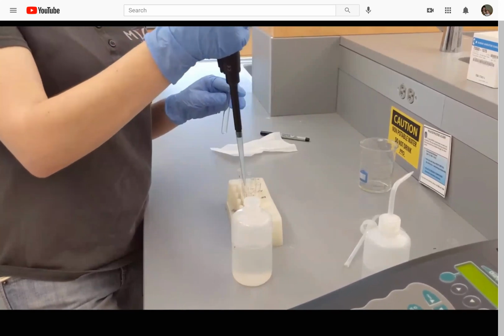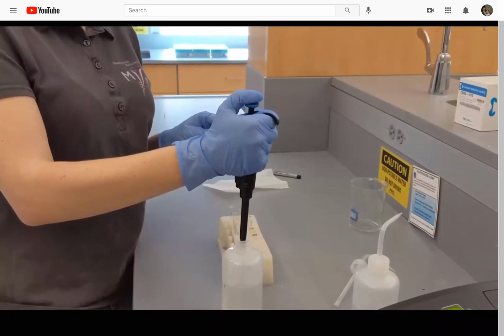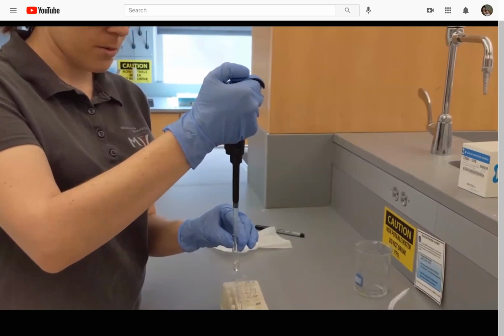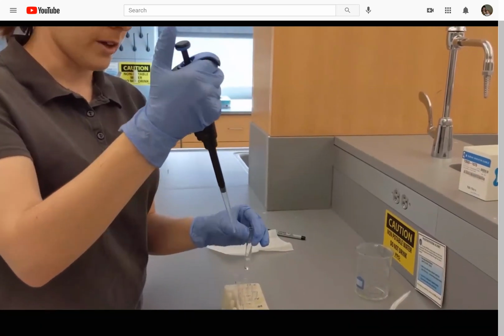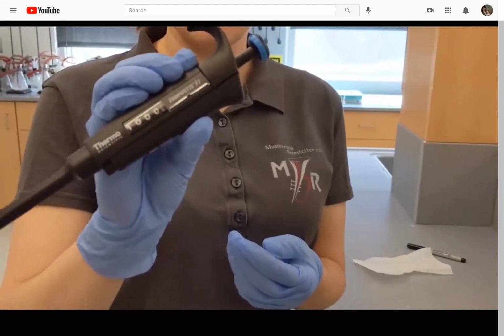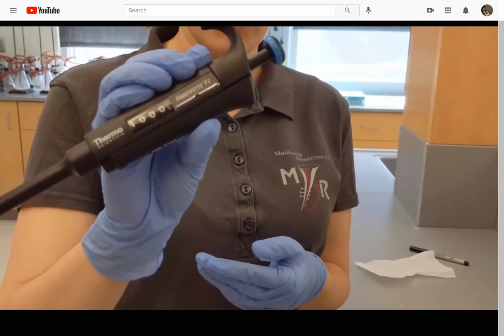You want to make sure that you never tip this micropipette upside down when it has liquid in the tip. This will ruin the micropipette because it will get the mechanism essentially clogged with liquid, and that's going to cause problems. So if you take a look at the side of the pipette, you can see that's reading at 1,000. It's 1,000 microliters or 1 milliliter.